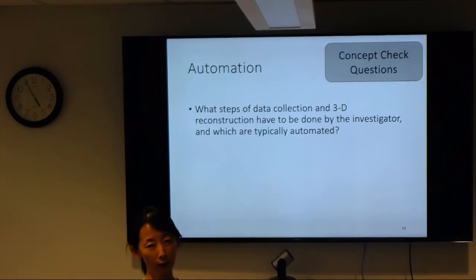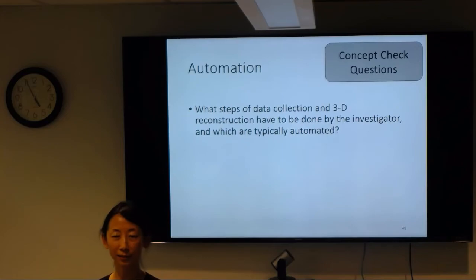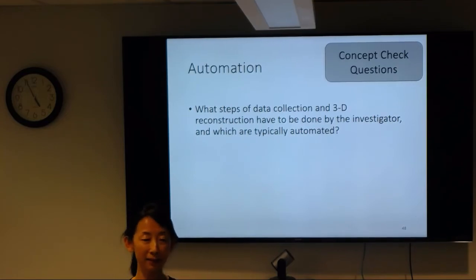You pick your targets, and then you go home. The microscope will automatically collect your data for you. I believe here you can also automatically do the frame alignment on the fly. Tomogram alignment and reconstruction depends on your sample. You can always do it, but whether it works or not is sample dependent.